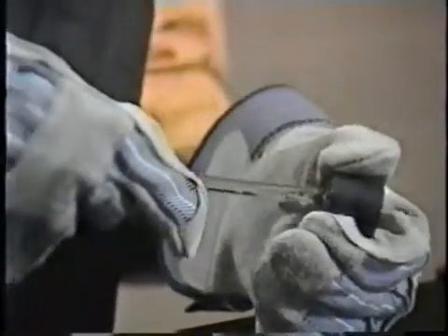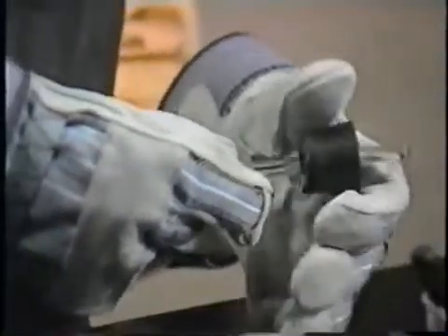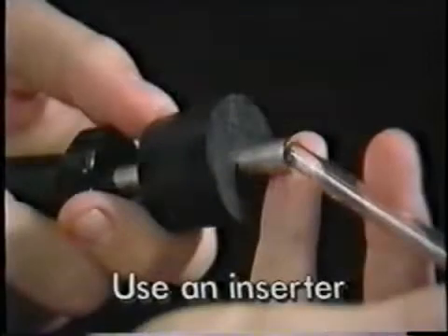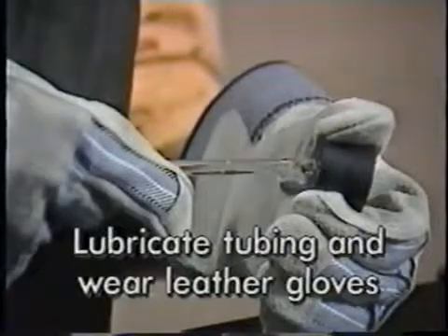If you don't have an inserter, lubricate the tubing instead and protect your hands with leather gloves. Push the tubing gently through; rotate it if there's any resistance. Use the same care when removing it, and don't forget to wash off the lubricant. To summarize: use an inserter to place or remove glass tubing in a stopper, or lubricate the tubing and protect your hands with leather gloves.